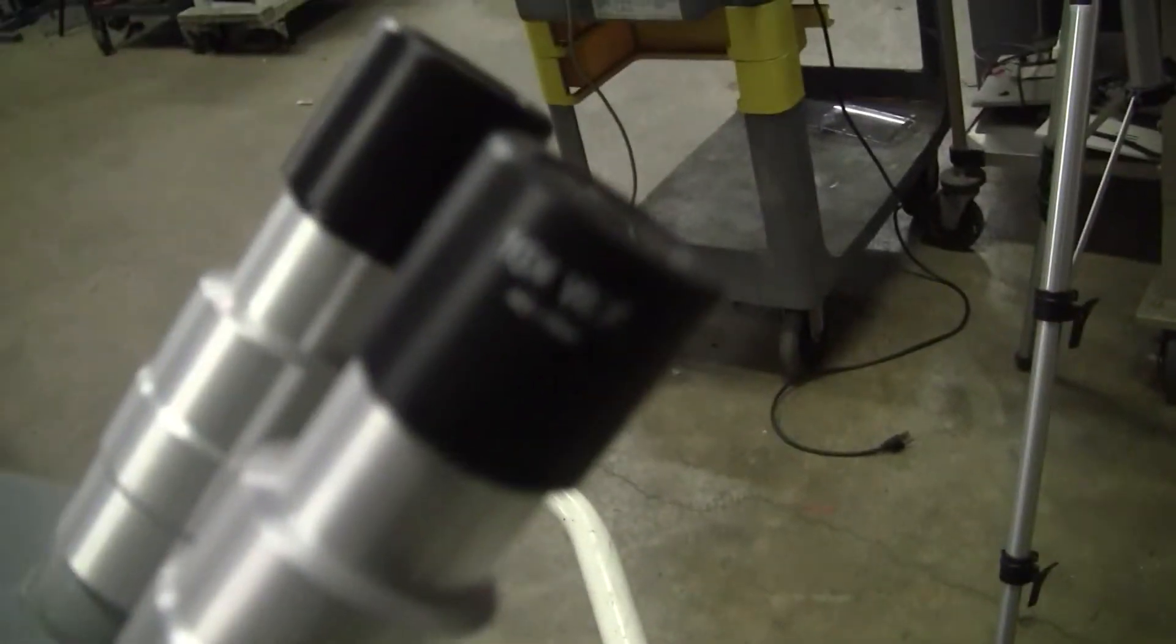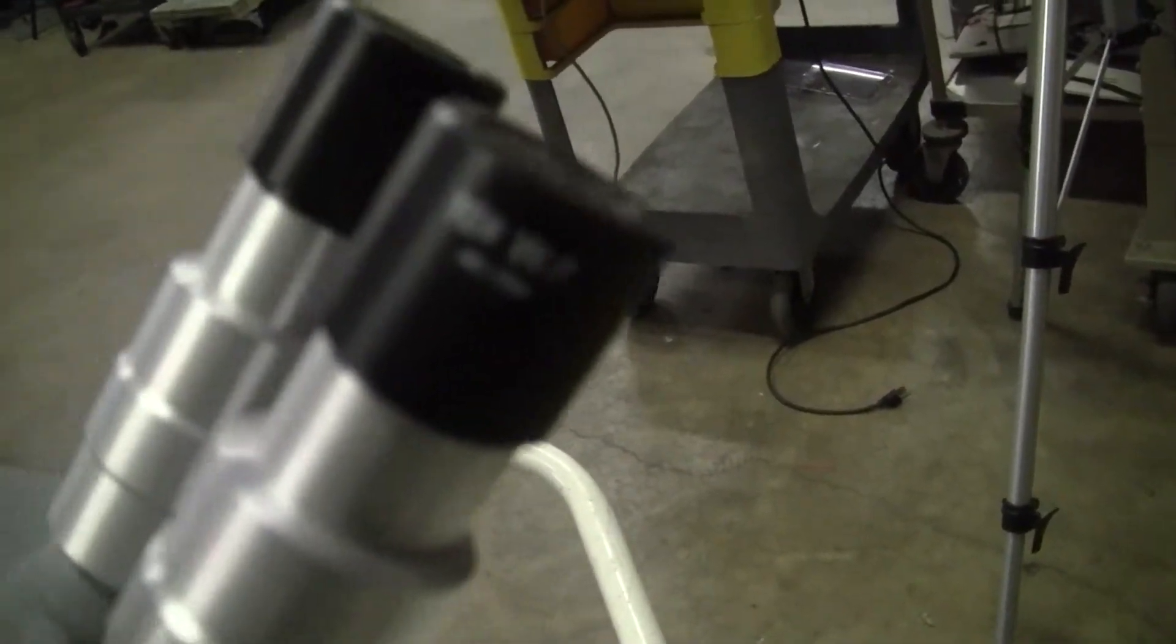Let's take a look. It has wide field eyepieces 10x. It has three objectives, room for a fourth.